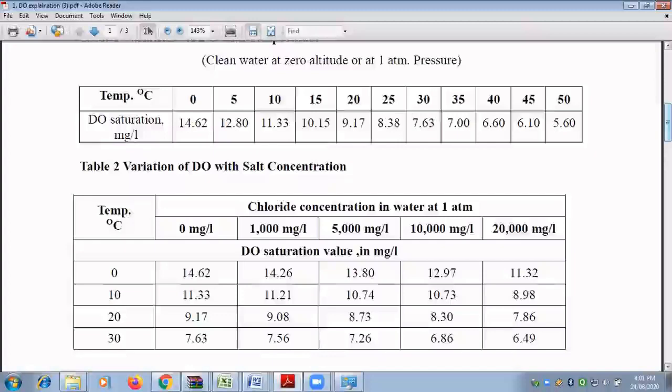Now, why is it getting liberated? The structural oxygen has a bond with hydrogen, and with an increase in temperature the bond will get weaker and weaker, and at a suitable temperature it will break, releasing the oxygen.